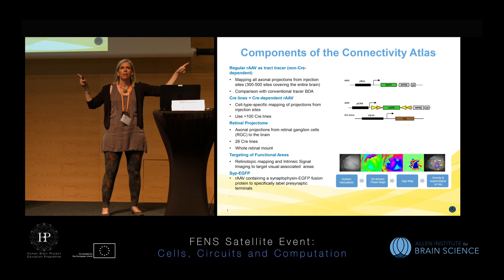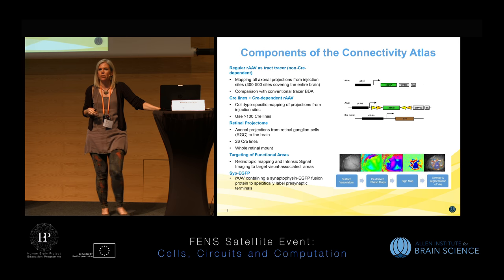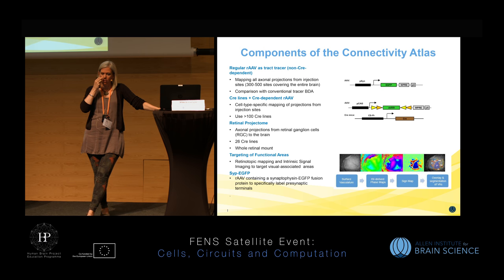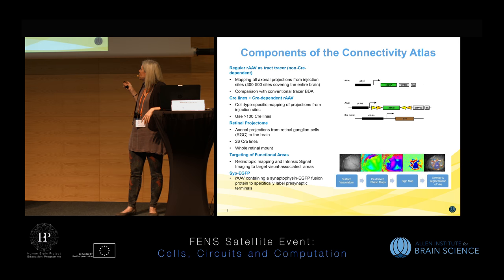You can tell me this is the area of the visual cortex, and structurally you can't really see any of the delineations, but functionally there are many different regions, and we're actually interested in some of the secondary functional areas as well. And so the only way to look at those areas is to create a sign map.